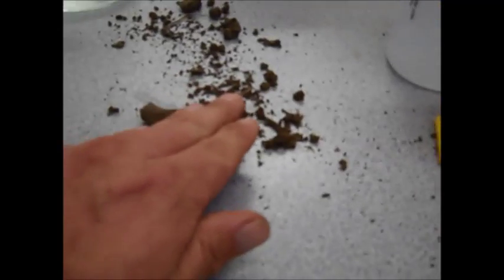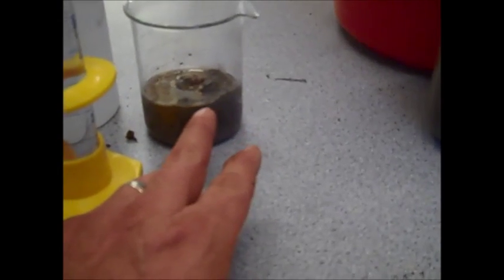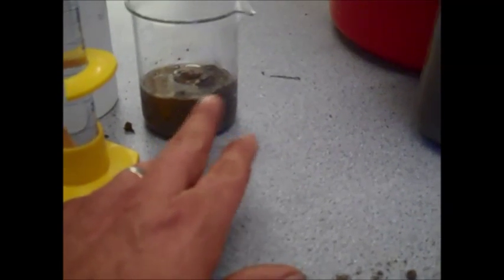And so this, feeling it, helps me decide what these layers are here. I can see the coarseness and the graininess down below here, so I'm going to say that's sand. I see a small fine layer that might be silt, and I see a big layer of clay, which then helps me to decide what I saw here and make percentages and make decisions on the textural triangle, where the pore space then also helps me to understand. 24% pore space is not very much, and so this soil, it's telling me this is a highly clay soil, and so then I'll use the three of these things to make a decision about my soil.